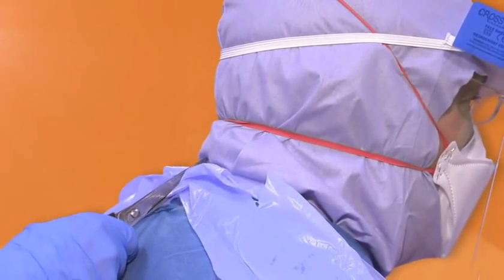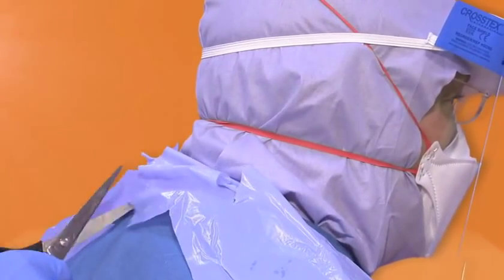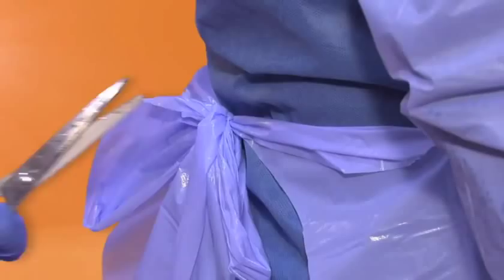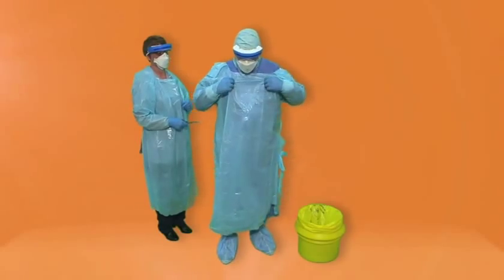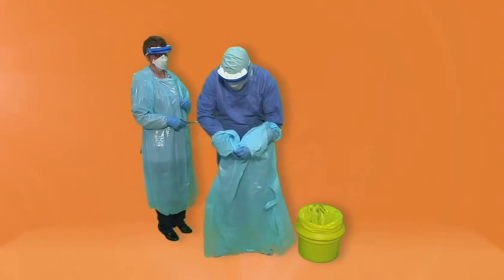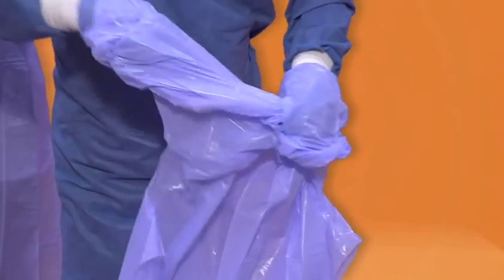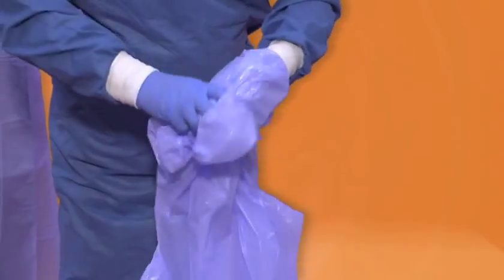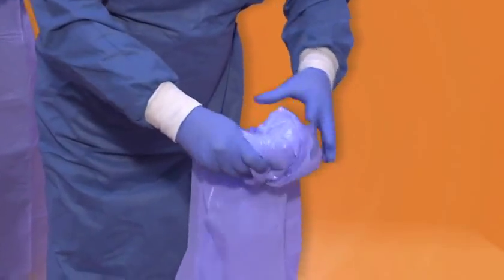Apron. Using disposable scissors, get your buddy to cut open the rear of the apron at the neck using the non-touch technique. Leaning slightly forward, peel the apron forward keeping the contaminated area away from you. Turn the apron inside out and wrap the apron so that the dirty side is now on the inside. Dispose of the apron as clinical waste in a yellow bag.